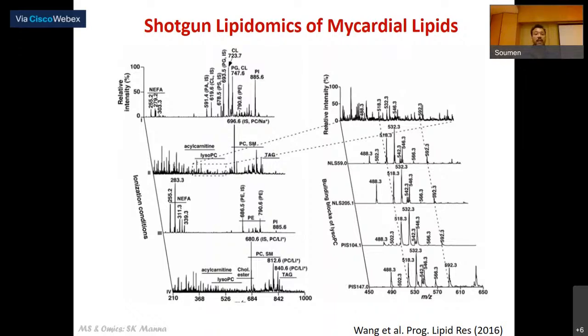However, the fragmentation pattern for metabolites, because they are so diverse in nature, and you don't know what else you are looking at, as we have given some examples where you have no clue, like there are different types of novel metabolites that may be present. So it becomes challenging to use a shotgun approach in the case of metabolomics. However, in principle, that could be done as well. So what you do in shotgun lipidomics, or for that matter, we'll also discuss shotgun proteomics.